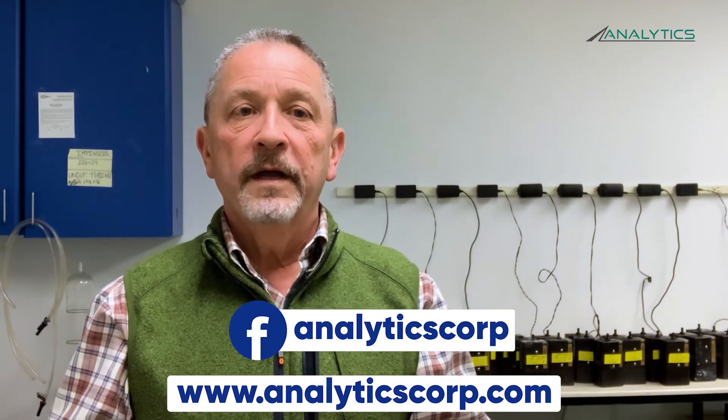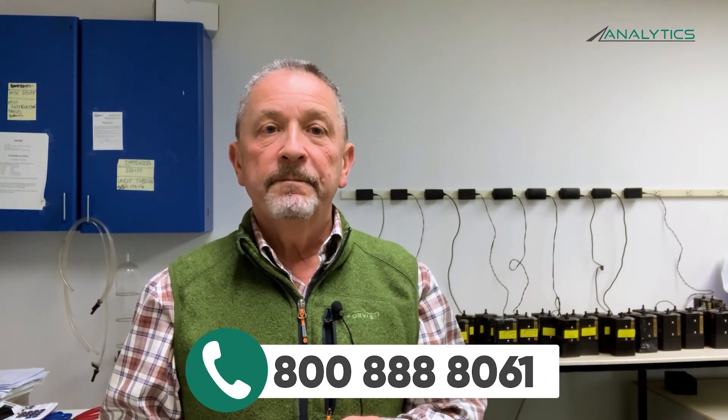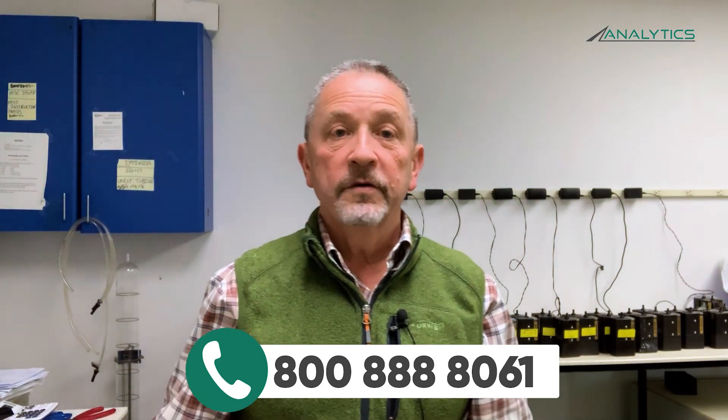That's it — it's that simple to collect a sample using a PPI. If you have any questions, our customer service and technical groups are available from 8 o'clock in the morning to 6 o'clock in the evening. You can call or email us and we'll be glad to help. Please give us a call at Analytics Corporation, 804-365-3000, extension 5108, or our 800 number, 800-888-8061. Thank you, and have a good day.